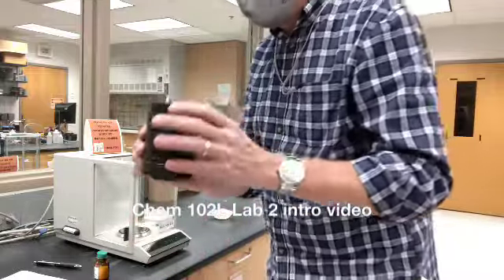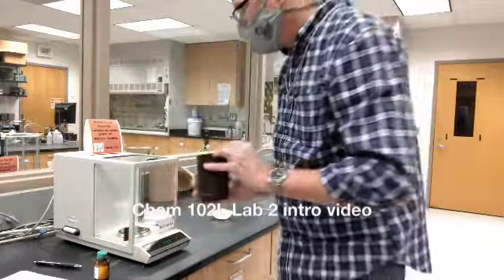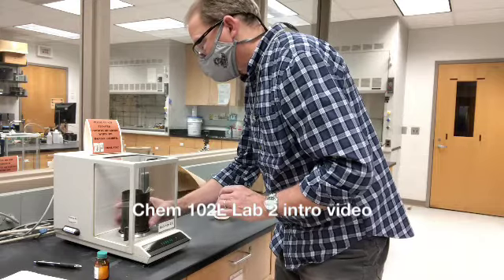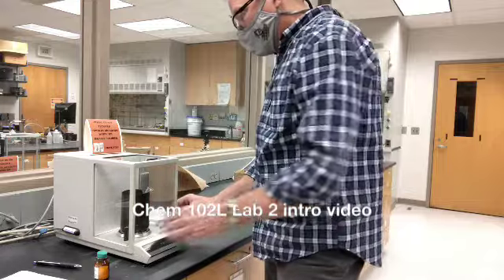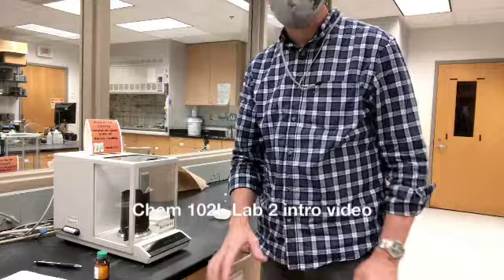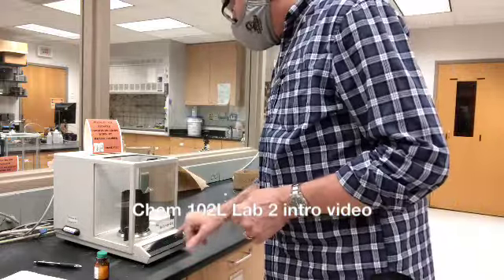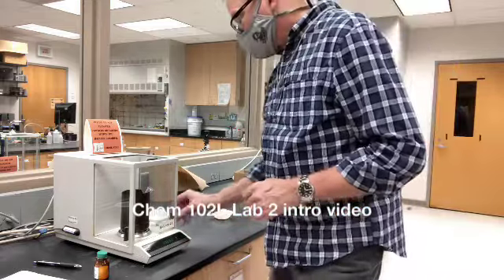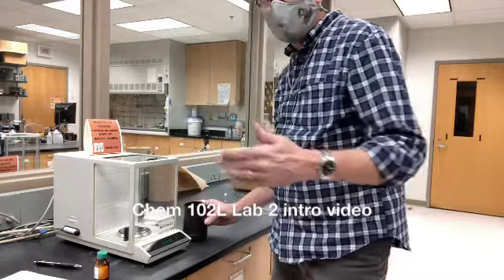So I'm taking this combination of the support, the test tube, and the stir bar, and I'm putting them in the analytical balance. I'm turning it so that the test tube is kind of pointing out the side. I close up the balance and I press the bar, and that's what we call taring, and it gives me a value of 0.000 on the scale.